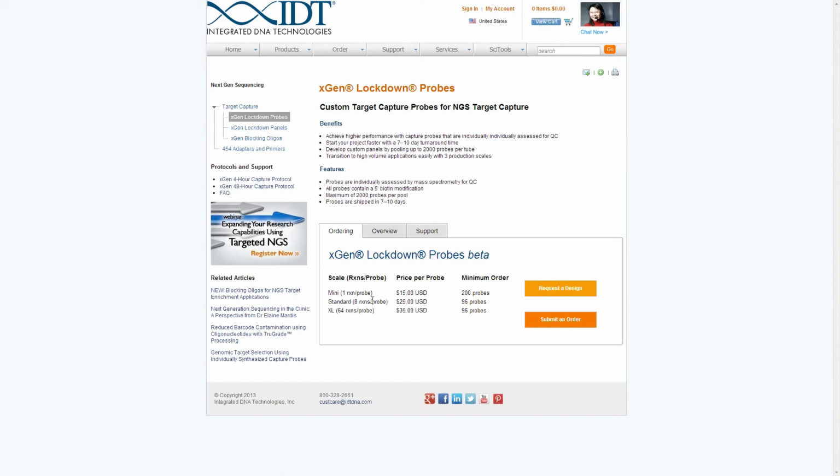Okay. I'm going to come back to a question for Rami then. So in the data that you presented, Rami, you showed that there were roughly 30 to 40% of the reads that were off target. I'm not sure exactly which slide that was, but this person wants to know what would be found in those off target reads. What would those sequences be?